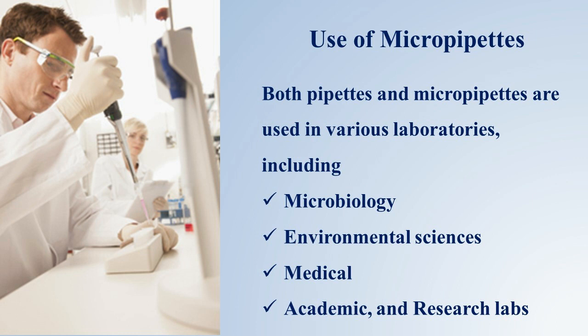Use of micropipettes. Both pipettes and micropipettes are used in various laboratories, including: 1. Microbiology. 2. Environmental sciences. 3. Medical. 4. Academic and research labs.